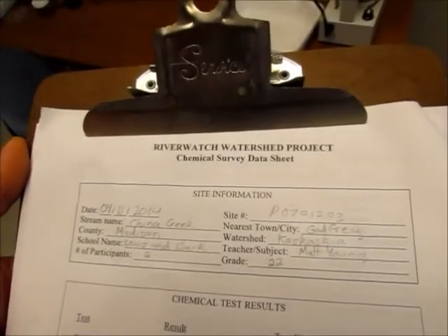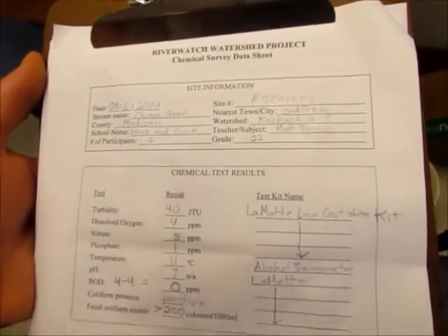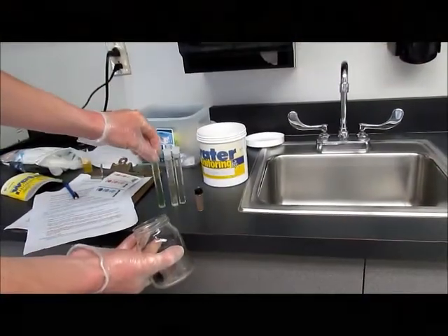After you're done with your LaMotte kit water chemistry survey, look over your data sheet to make sure all the lines have been filled in and check for any errors. Looks like our data sheet is complete.